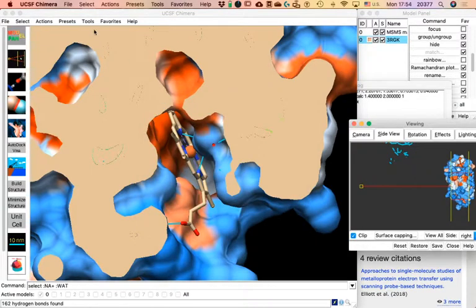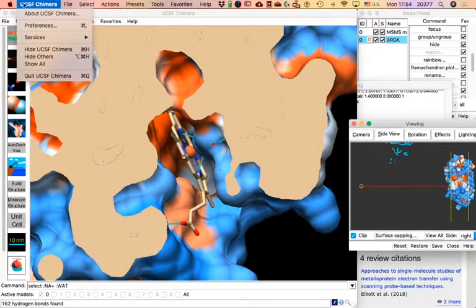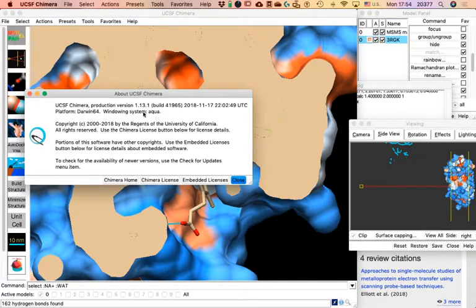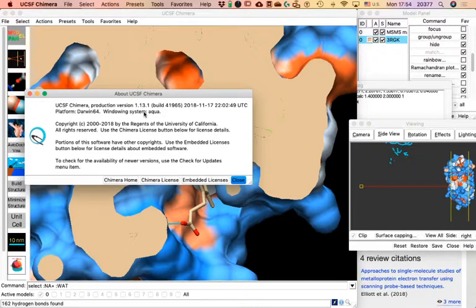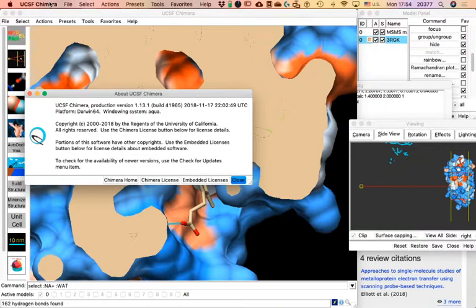Can you all check if you have the same version as I do? I have 1.13.1. Some of you have 1.14. Check under Chimera > About. That version difference may account for the different numbers we're getting.